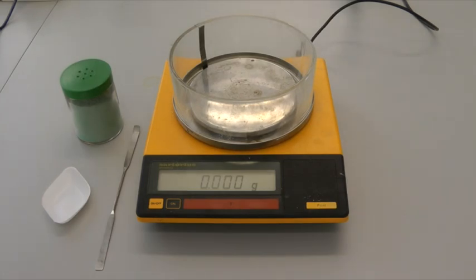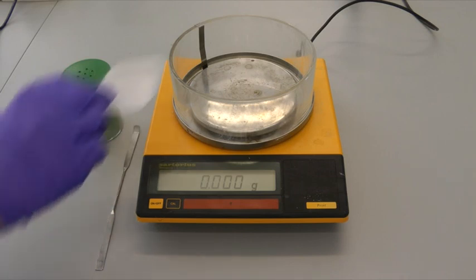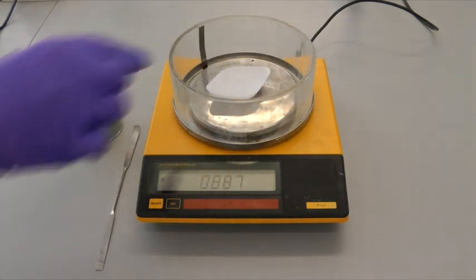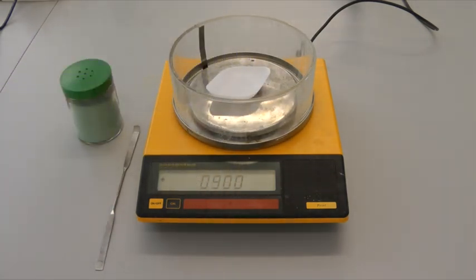A weighing boat or alternative container such as a beaker should be placed on the balance. The balance should then be zeroed or tared by pressing the appropriate button. Your teacher will give you guidance.